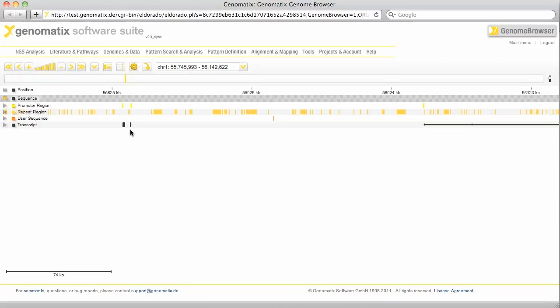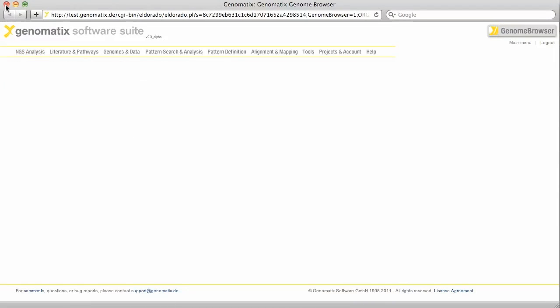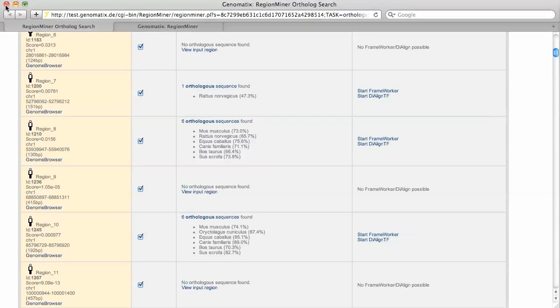Let's close the genome browser window and go back to our list. From here we can run a comparative analysis on the orthologous sequences.